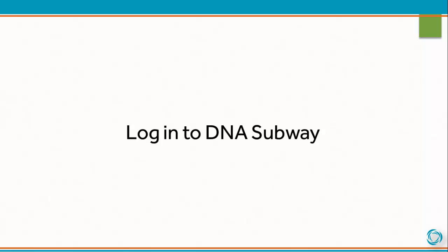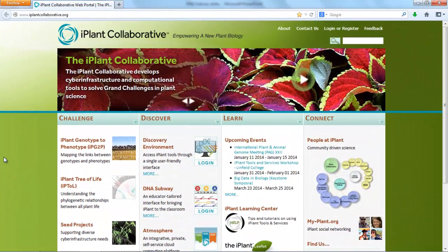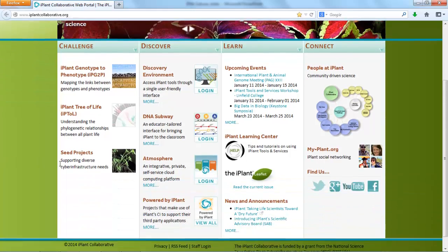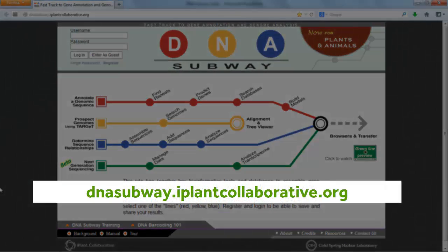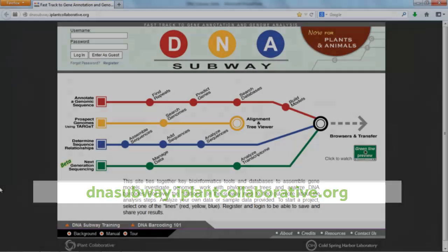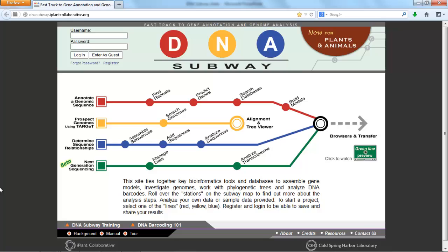In order to get started, please log in to DNA Subway. You can do this directly from the iPlant homepage, or by going directly to dnasubway.iPlantCollaborative.org. If you have an iPlant account and have requested access to DNA Subway, simply enter your iPlant username and password. You can also enter as a guest; however, as a guest, your work will not be saved.